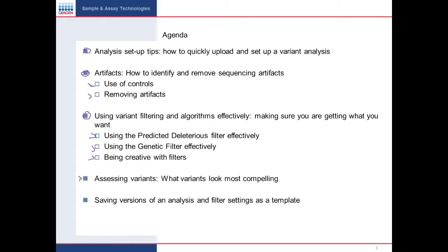When we get more toward the end of the presentation today, we'll be assessing variants. I have a handful of items that I usually walk through when assessing a variant to see, is it artifact? How biologically compelling is it?